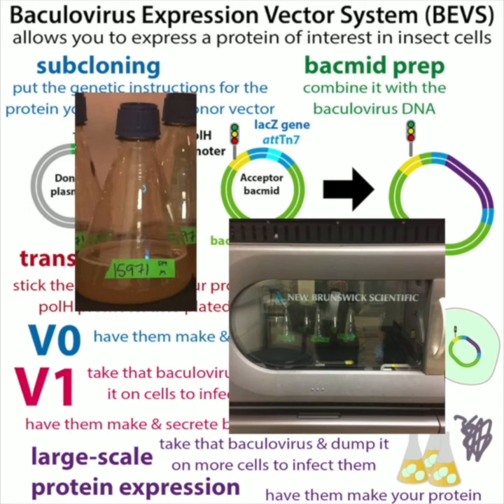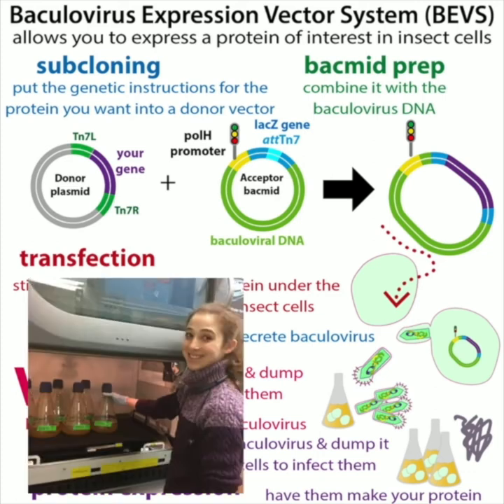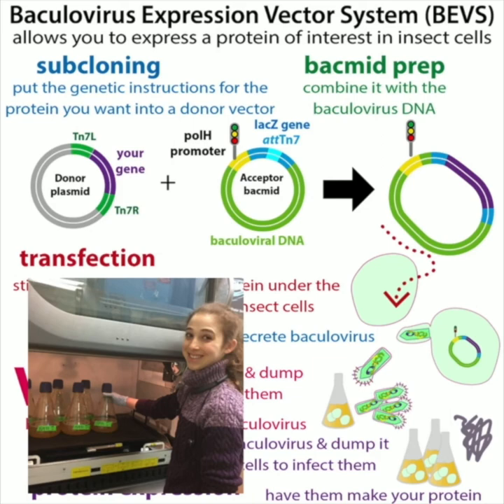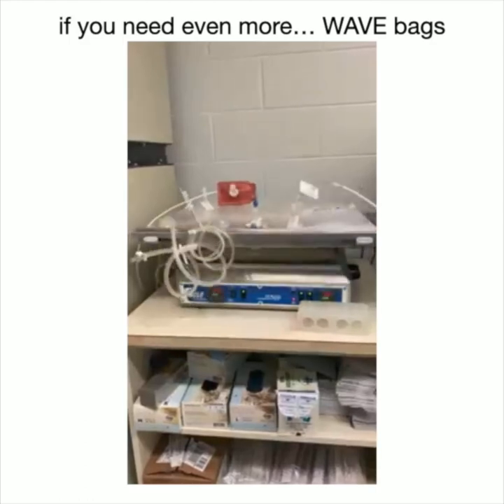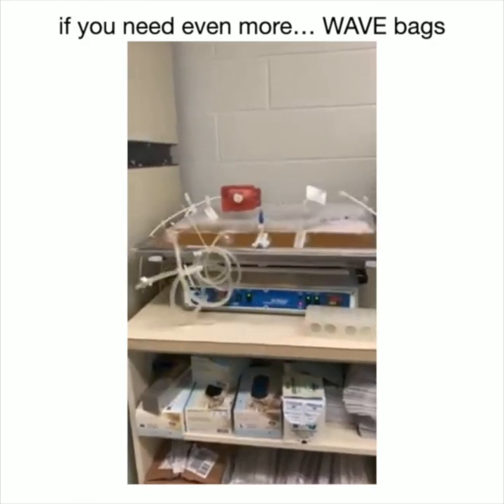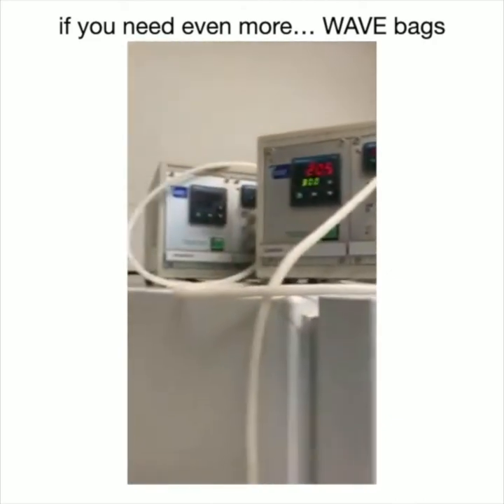If we want a lot of protein, we normally scale things up. We collect the media containing the secreted virus and dump it onto many liters of insect cells. If we need a lot more, we can switch to wave bags — the biggest thing we have in our lab. Industry has giant reactor systems, but these bags that can shake work for us.